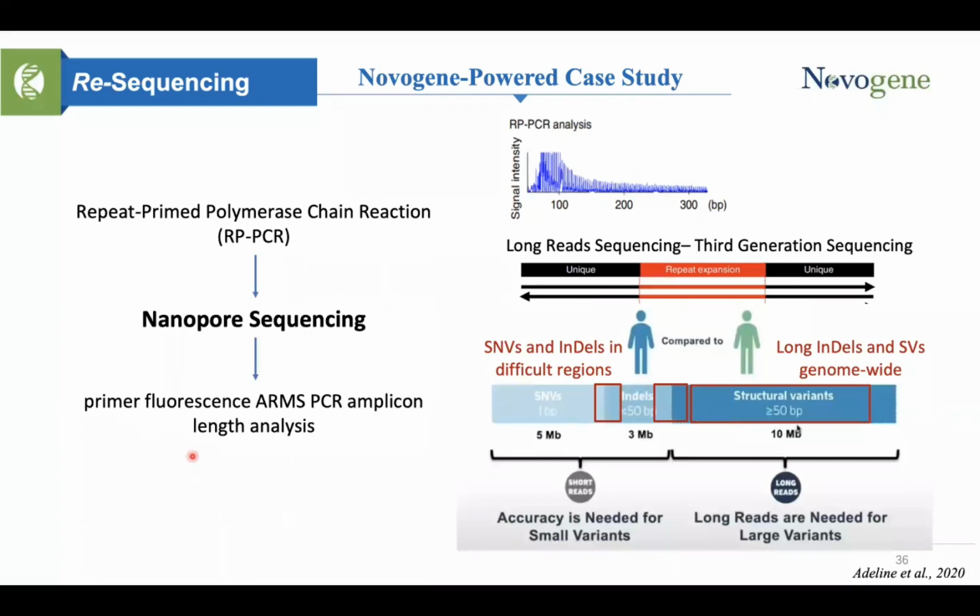Characterization of SVs is crucial to studies of neurological disease. However, due to the short sequencing length, NGS poses limitations on the study of these complex SVs, particularly those involving repetitive regions. So the study greatly depends on TGS.